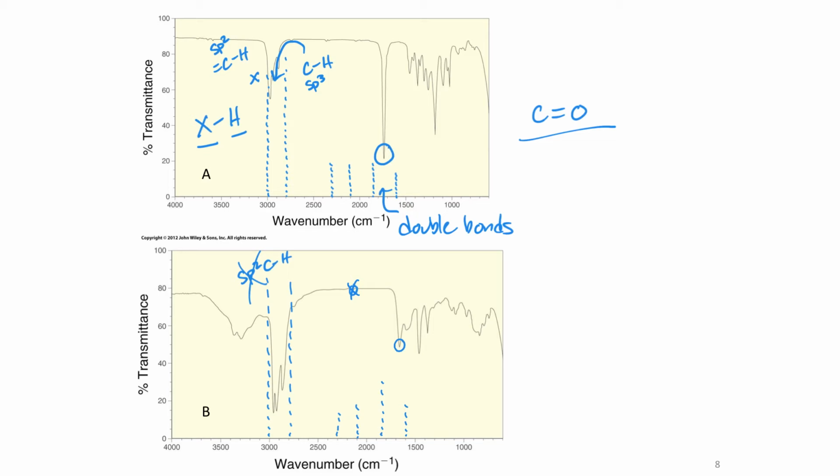The interesting feature of this spectrum is this hump-shaped region, and you'll see that it has sort of two smaller peaks on it. When I learned about this, I was taught it's sort of like a Bactrian camel, right? It has two humps. And so a large hump here, like I'm trying to draw with the wrong color, is generally indicative of hydrogen bonding. And that can come, of course, from OH or NH bonds. And OH bonds will be much more intense.